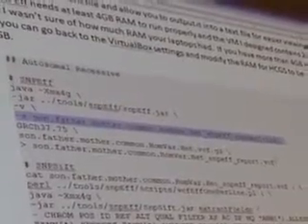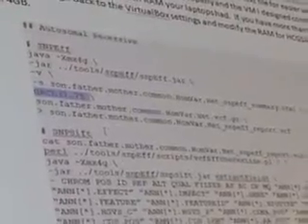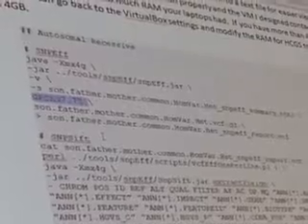Then I'm telling it I want to get back some sort of HTML file. I wanted to create a summary of what SnpEff found, and I'll show you what that summary file looks like. And then you tell it what version of the human genome you're using. Remember this morning I went on a lengthy description about making sure you know what versions you have, because at the end of the day, SnpEff only has certain versions of the human genome.